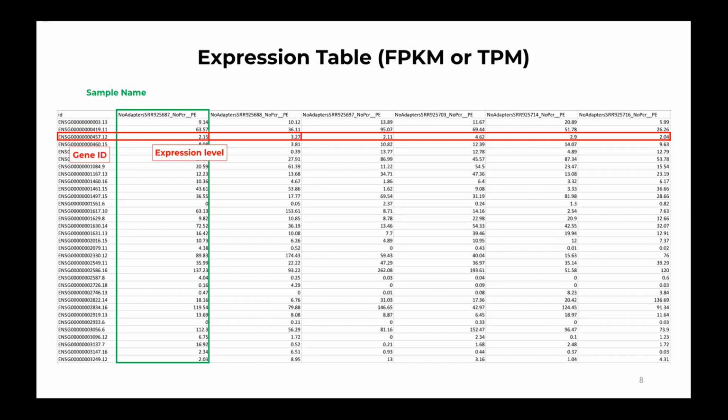So the table contains a lot of genes. One of the main challenges in the downstream analysis, which is what I'm explaining, is to find specific genes or gene sets and annotate them by their biological function. All these jobs or opportunities, the RNA-seq data analysis sort of things that you see, require you to go through these processes so that you can do some analysis which is meaningful. It's not just for the sake of doing it, but you're doing something which has some importance. So this helps us understand what expression difference can be observed in collective samples.